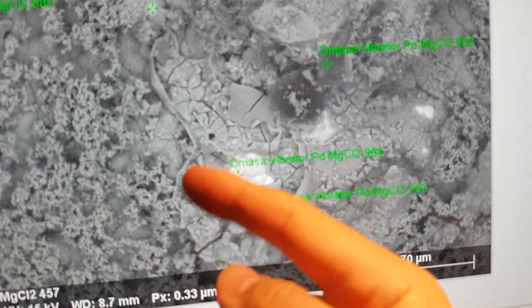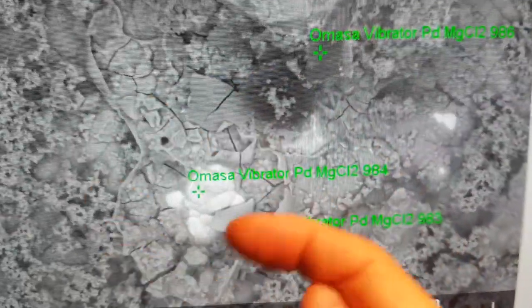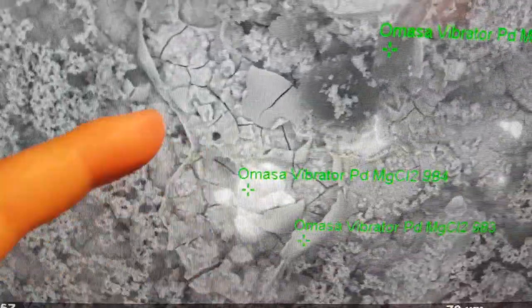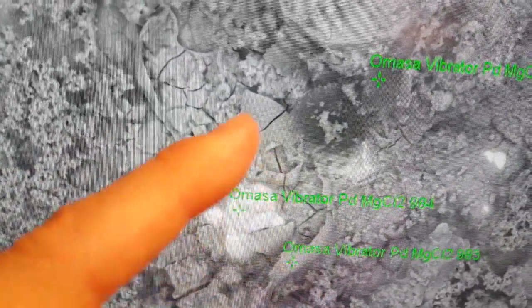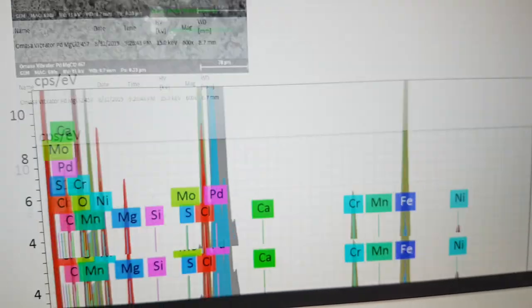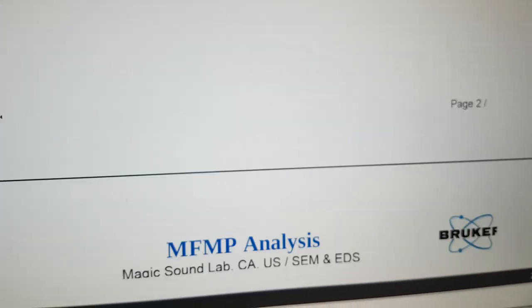So this one's quite nice. We have this kind of cleaned area here, but sort of equidistant from this you have this kind of area where there seems to be these bubble areas that maybe have gone over the top and exploded. This gives the suggestion that there was an expanded front of material that formed a bubble and then fractured. Maybe there's some gas being created. There's this curious little structure over here. These aren't the most exciting part of this presentation, so I think I might just skip that.